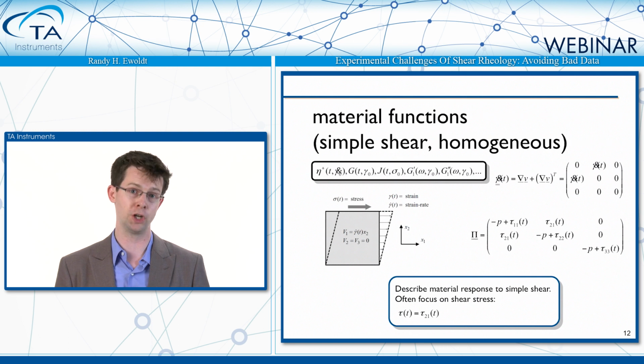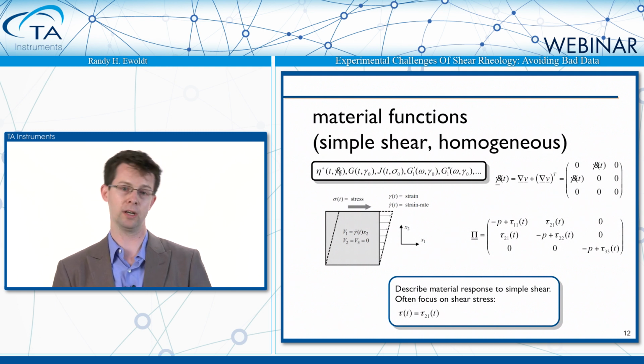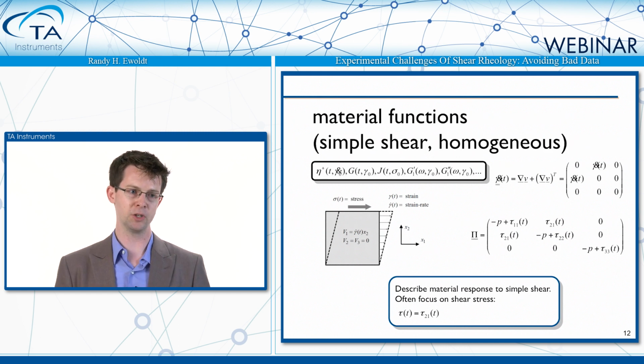I'm really going to focus on the shear properties, but I think in what we will talk about, you can see a pattern that could be matched for any material property, be it normal stress differences in shear or extensional viscosities, etc., but we'll really focus our attention on the shear stress component and the material properties from this quantity.